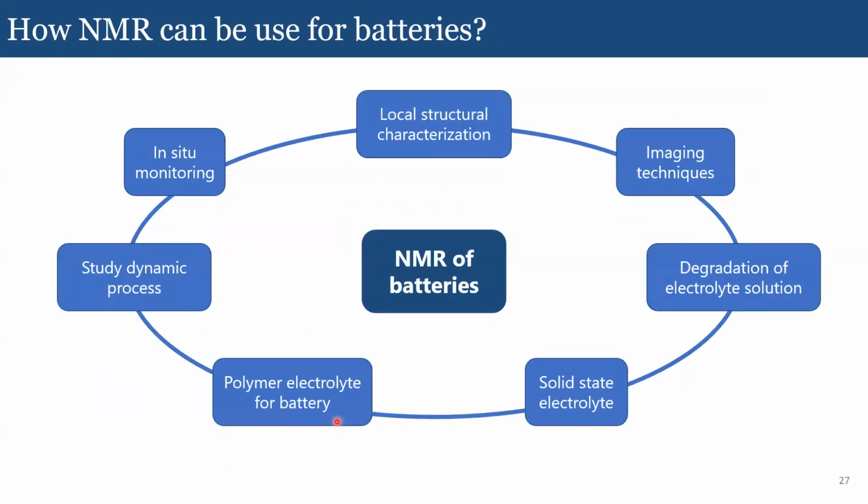So now, what can we learn with NMR of batteries? This is a list of all of the things you could do with NMR, and this is non-exhaustive. I'm going to try to walk you through this, and I'm going to start with the local structural characterization of batteries.